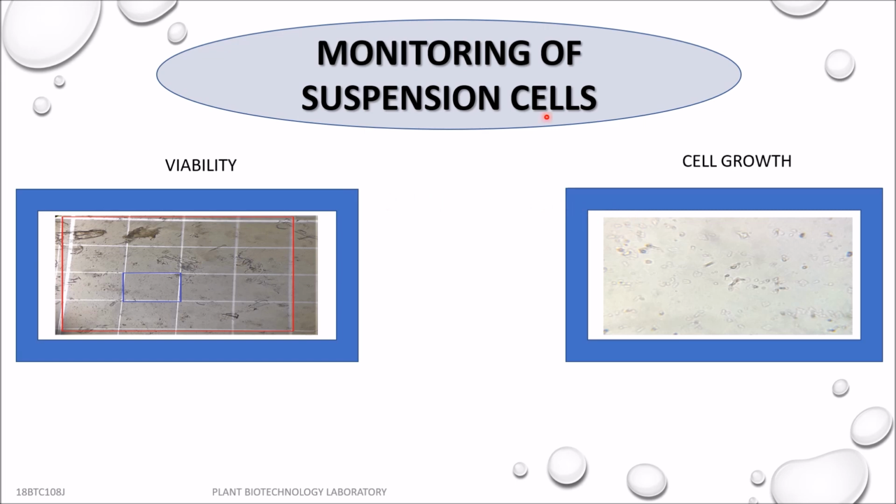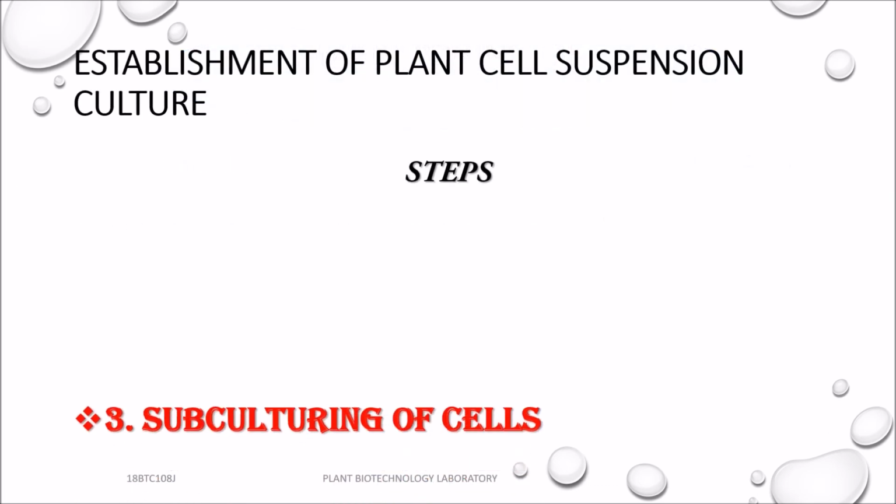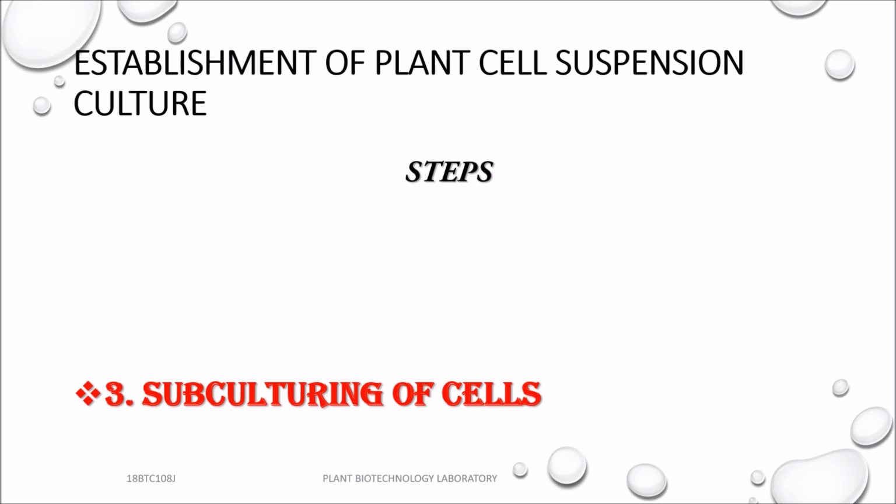When monitoring the cell suspension, once the cell density and the percentage of viable cells are known, the suspension cells are proceeded for subculturing of the cells into fresh medium.